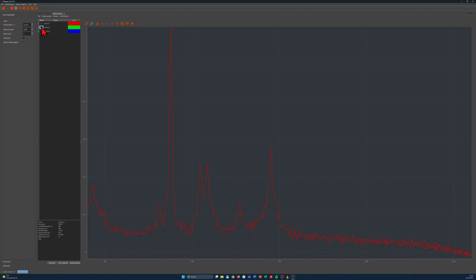show the spectra. In this section here, it's showing some metadata, the name of the file, device serial number, wavelengths, exposure time, and everything related to current file. Then let's just choose one spectrum, for example, alcohol 1. And what we can do here, if the file was saved, we can open the file. We can save current file, we can save selected files. We can look at the history as well.